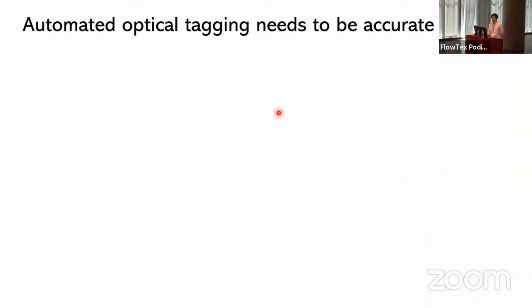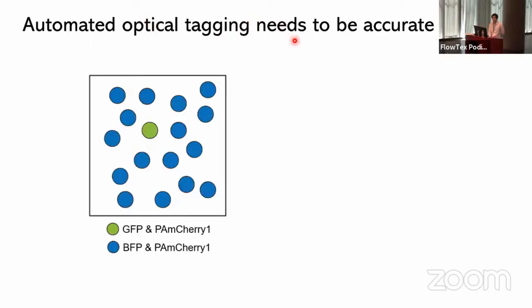Next, we needed to automate the optical tagging process, because you can't have someone manually tagging hundreds of thousands of cells in front of the microscope. So we wanted to automate the entire image analysis and optical tagging process and characterize how precise this method is. We had an experiment with two populations of cells, one expressing GFP and PA-mCherry, and the other expressing BFP and PA-mCherry. Then we diluted the GFP-positive cells 1,000-fold so that they were a minor population of cells.